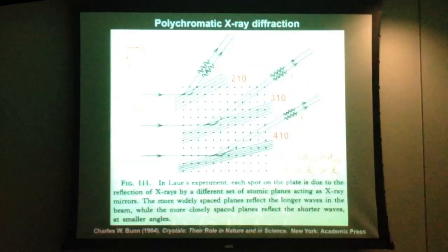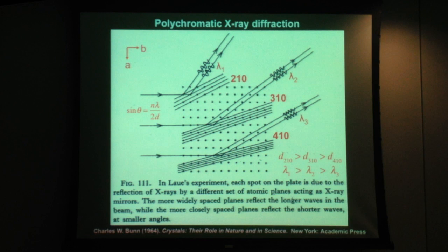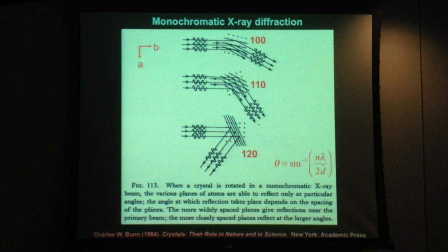To the question about that slide, does that not also illustrate the order of the scattering angles? In the previous slide, they showed a rotating crystal. Right. So here we have a single wavelength, but a rotating crystal. And so do you need to rotate the crystal in order to expose those different planes? Right. If the crystal was just sitting in a fixed position in the incident beam, such that the 110 plane satisfied the Bragg condition at that position of the rotation of the crystal, then the other planes would not be satisfying the Bragg condition for the higher order one.